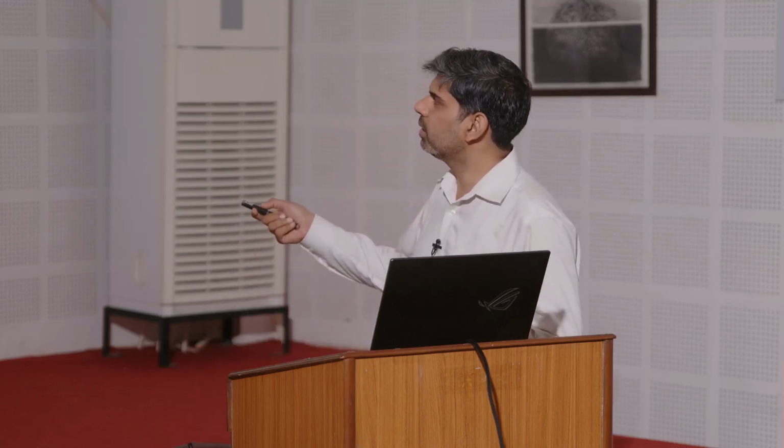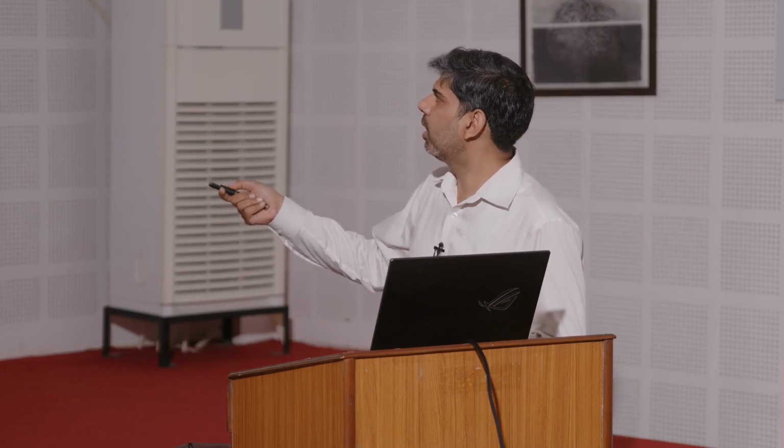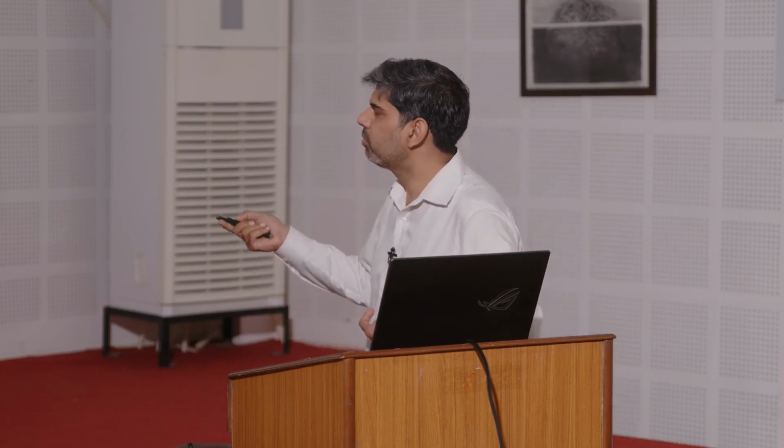Another effect is electromigration. You have ions in the bulk solution, and they are also going to migrate under the effect of the electric field. The positive ions in the bulk solution are going to move towards the negative electrode, and the negative ions are going to move towards the positive electrode. This phenomenon is called electrophoresis or electromigration, and the velocity of the ions, for small ions, is also typically proportional to the electric field, and the proportionality constant is called electrophoretic mobility.